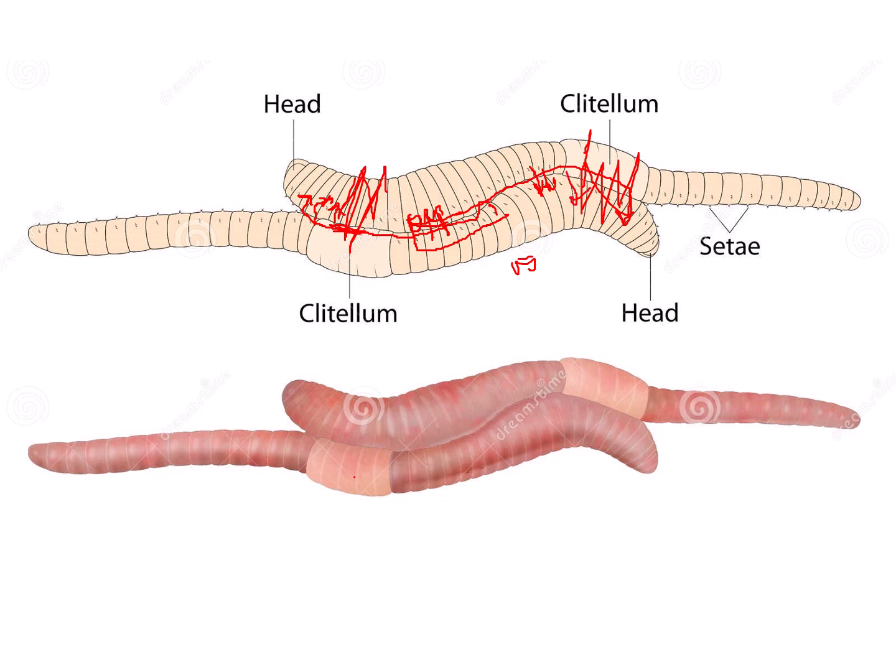These animals would then separate, and when their own eggs mature, the sperm gathered from the other individual come out and fertilize their eggs. The fertilized eggs run in the seminal grooves and reach the clitellum, where they get mucus, and they make a cocoon of mucus around them, and they are shed in the environment, and later on they get hatched.